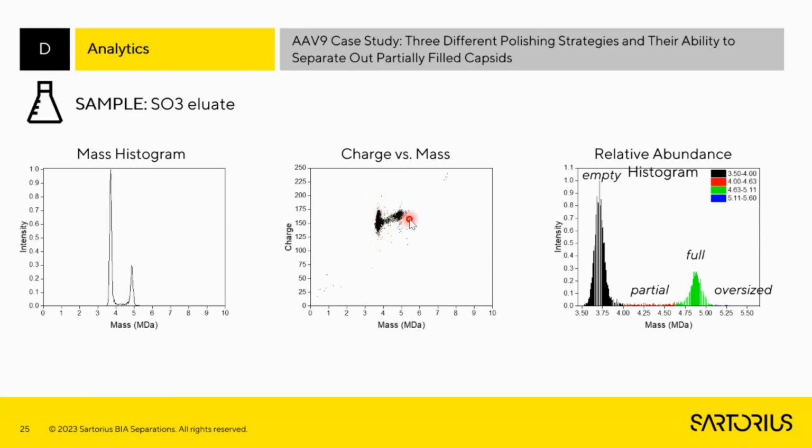If we know that an ion exchanger separates based on charge, this is the answer why QA could not reach 99% fulls, or why there are always some empties below our full peak, because a higher heterogeneity of empties is evident compared to the fulls. Therefore, when we reach those conditions, those portions of subspecies of empties will elute also with our fulls.